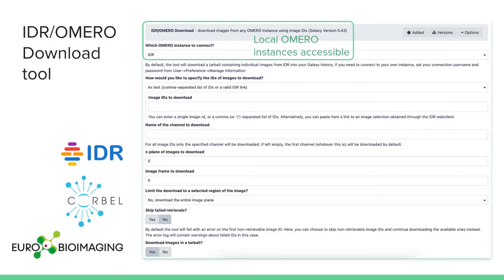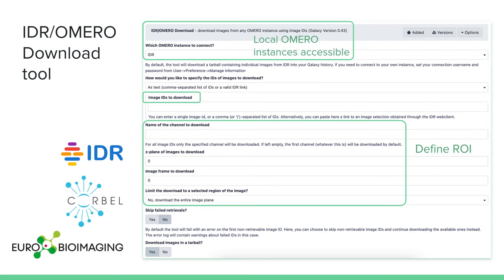I've only briefly mentioned before the access to imaging data from Galaxy. There is a tool called the Image Data Resource or Omero download tool. As you can see in the screenshot, the first thing to choose is whether you want to go to the public archive — that is the IDR — or pick images from a local Omero instance accessible to Galaxy. Then you can indicate which image IDs you want to download into your history. Finally, you can select a region of interest: which channel you want, which z-plane, if there is a particular frame to capture from a time-lapse image, or if you want to crop the image before downloading, so you only take the section you want to analyze.